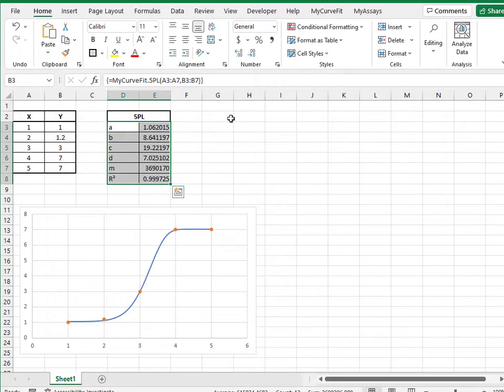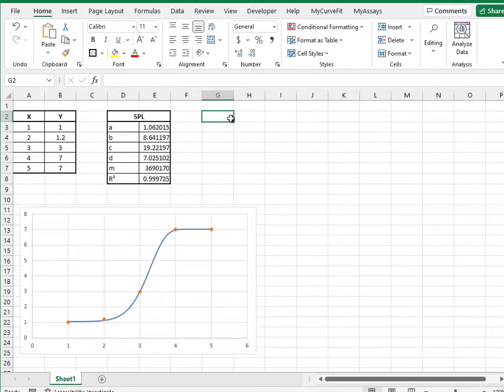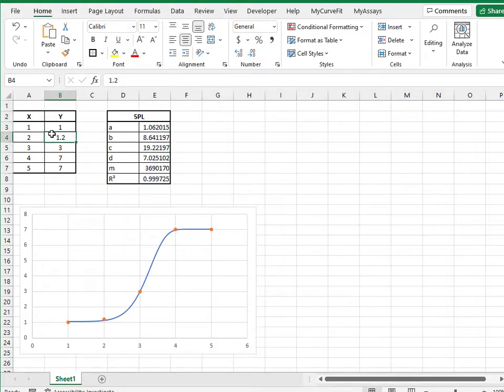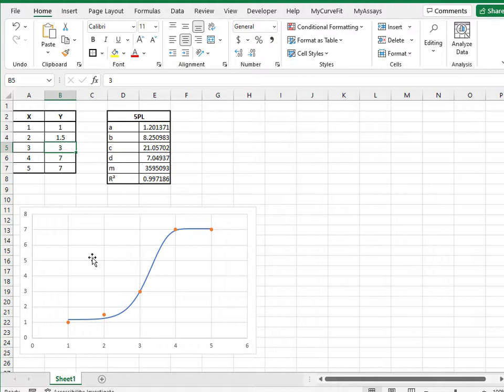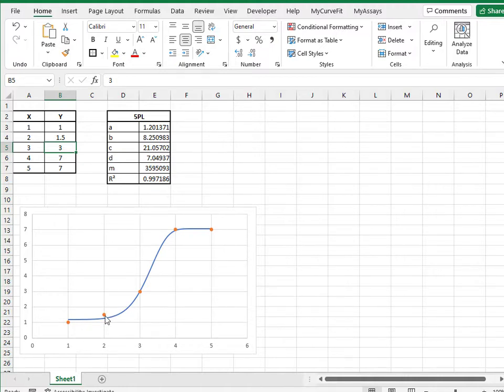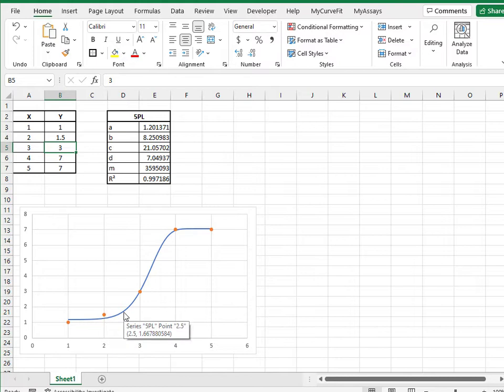The coefficients are calculated, and will automatically update if the X or Y values of the data points are changed. The chart I've configured here is also automatically updated, displaying the data points in orange dots, and the 5PL fit as a blue line.